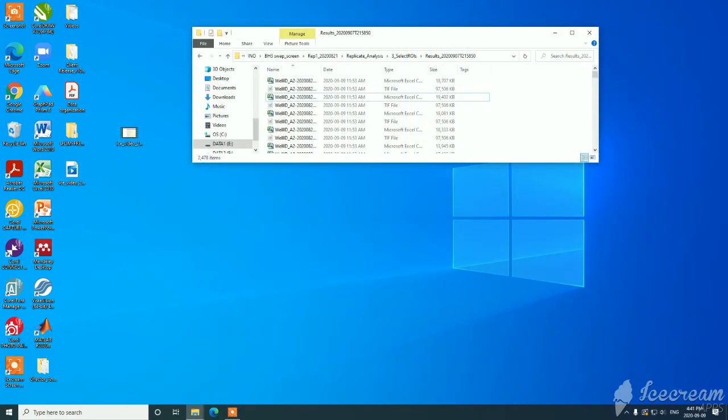So by the magic of video, I have run the batch analysis for a large screening data set in our BH3 swap screen rep 1. You can see I have a total of over 2,000 files here. And for each well, I have multiple fields of view.